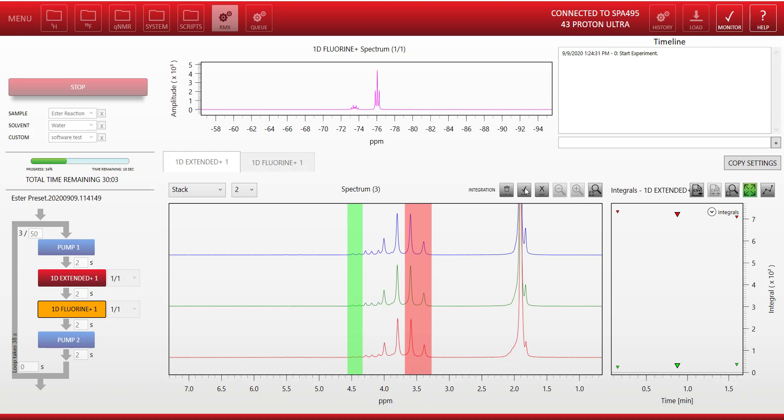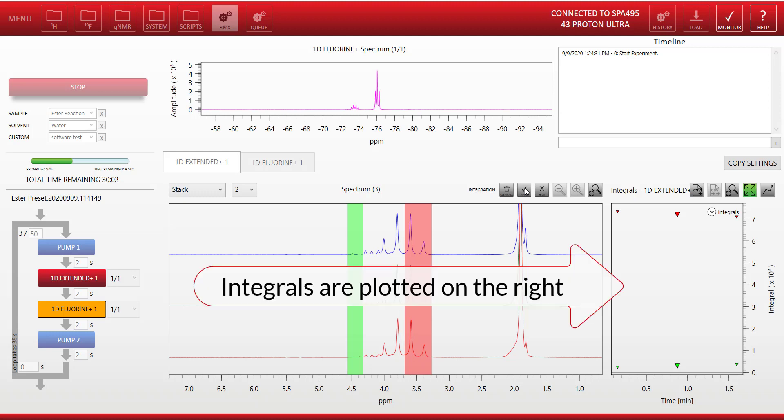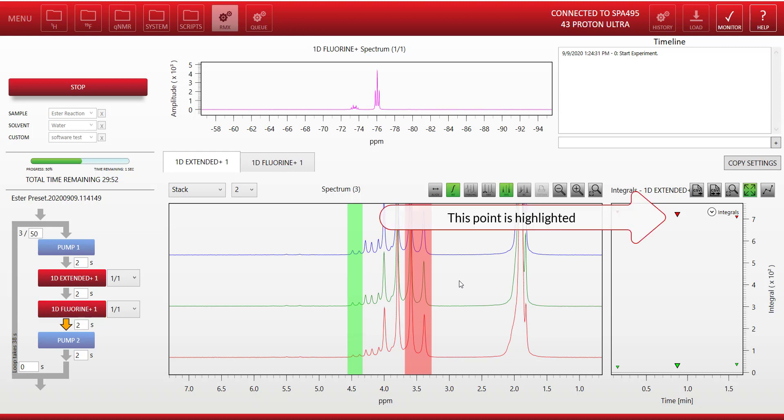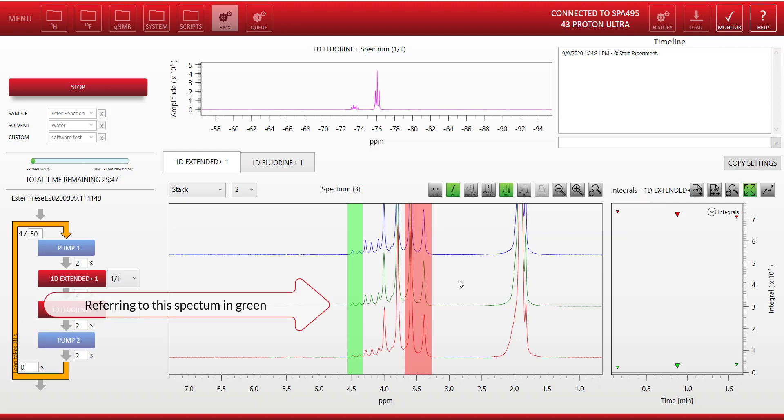Now once we've set those integrals you'll see a new graph appears on the right, which is showing those integrals and how they're changing with each particular scan. You'll notice that one of the points is highlighted a bit stronger, and that shows you the highlighted spectrum in green in the stack plot.